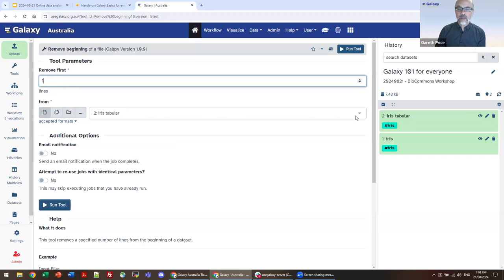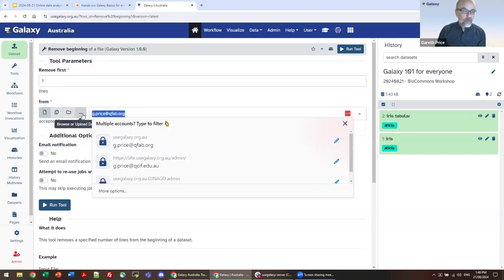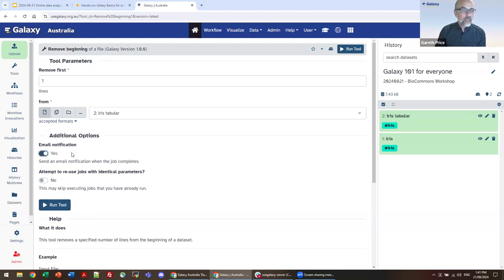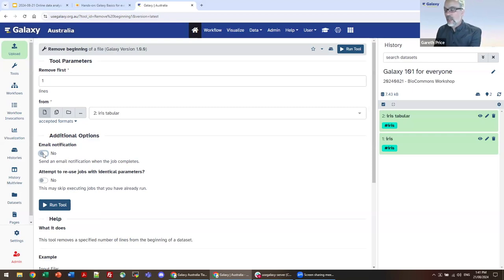Galaxy will always pick the uppermost file — the file with the highest number that conforms to the format this tool can take. Down at the bottom of the tool form, you can set it to email you when the tool is finished. For a long-running job that requires GPU access like 3D protein visualization with AlphaFold, you might want to turn this on so you get a prompt when the tool is finished and you're reminded to come back to Galaxy.